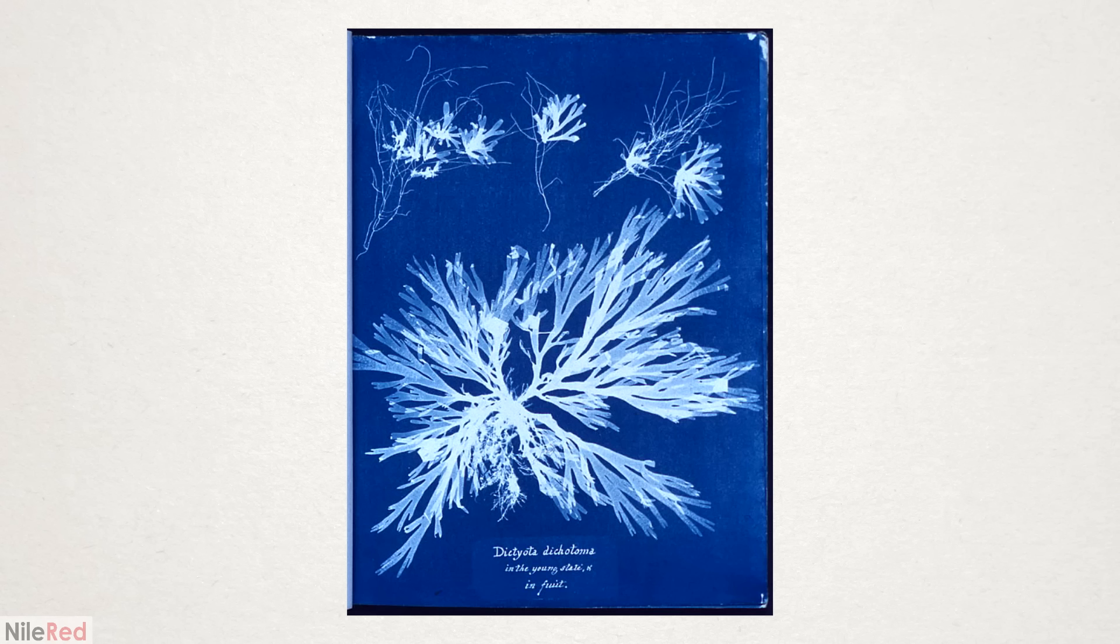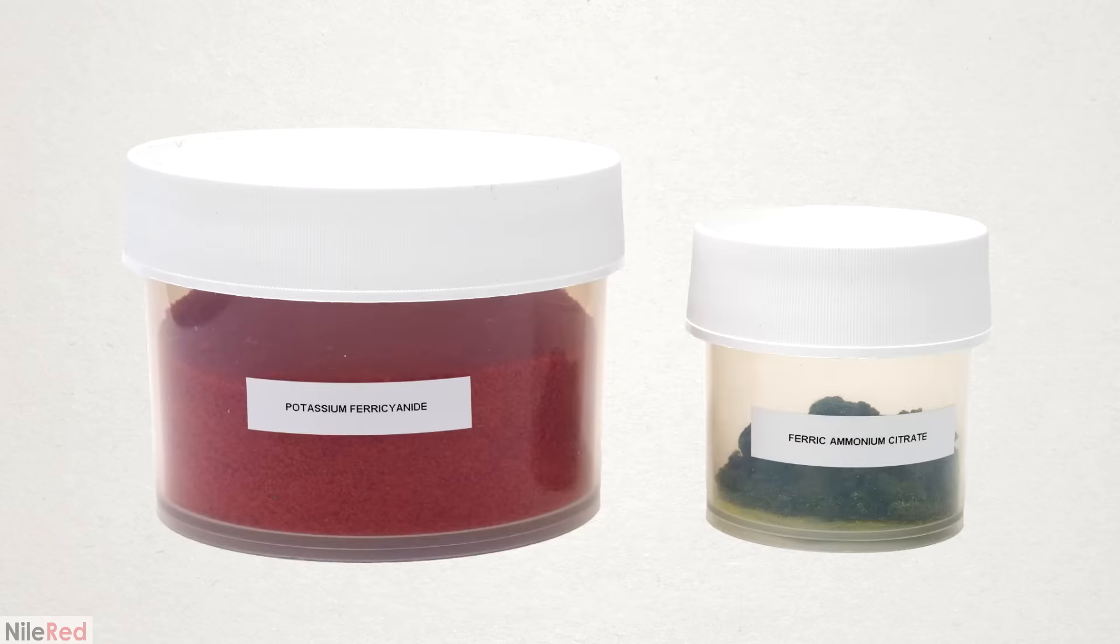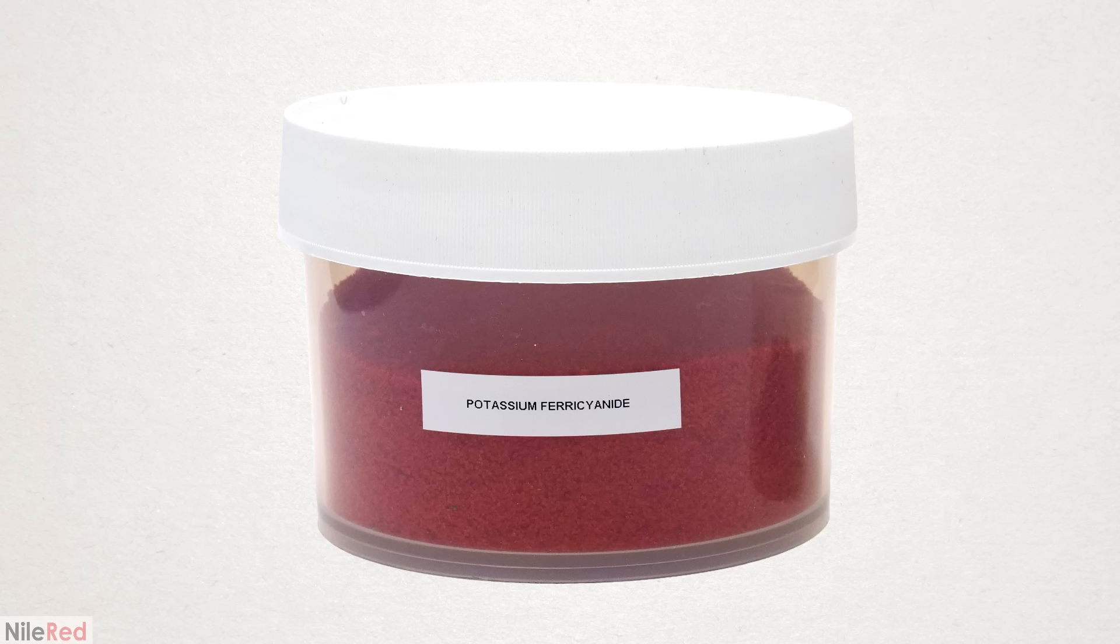In this process the Prussian blue is formed directly in paper and it was classically used to make blueprints. Over the years many different formulations were used, but the most popular one uses potassium ferricyanide and a UV sensitive iron compound called ferric ammonium citrate.